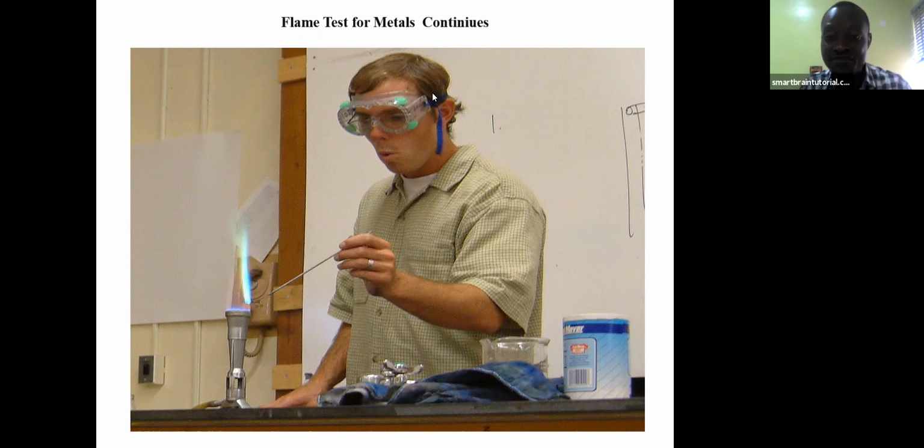Here is a picture of a student carrying out a test in the laboratory. Now you can see here we have a Bunsen flame which is supplying a very hot flame from a gas. Now, this is the platinum wire which is holding, and then the sample is attached at the tip of the wire and exposed to the flame.